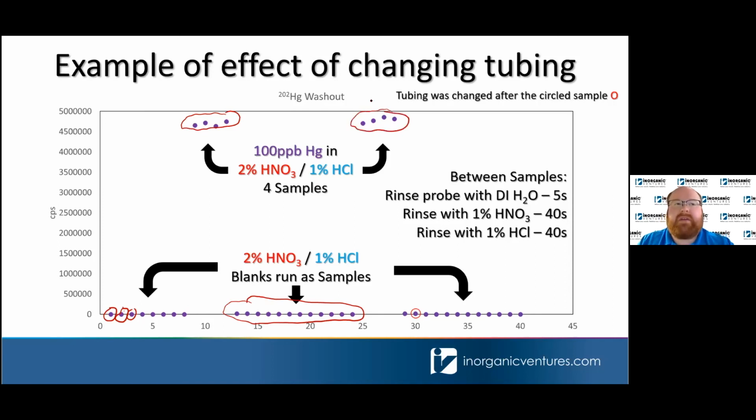So it should have relatively the same amount of sticking to the peristaltic pump tubing, but we're going to let it rinse out, give it a chance with 2 rinses, and then at this second rinse, we're going to actually switch out the pump tubing with fresh tubing. So we're going to pause the run, switch out the tubing. Fortunately, the plasma doesn't go out. It's one of those robust plasmas that you can introduce a little bit of air and it won't make it upset. But then we resume the run and let the rinses continue. So the next graph, we're going to zoom in.